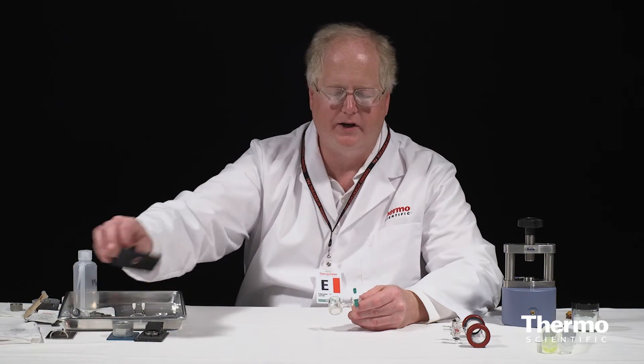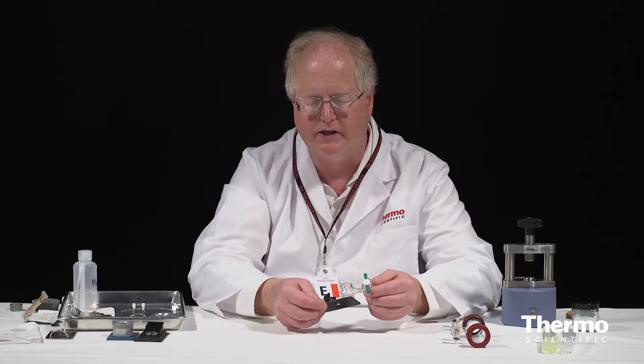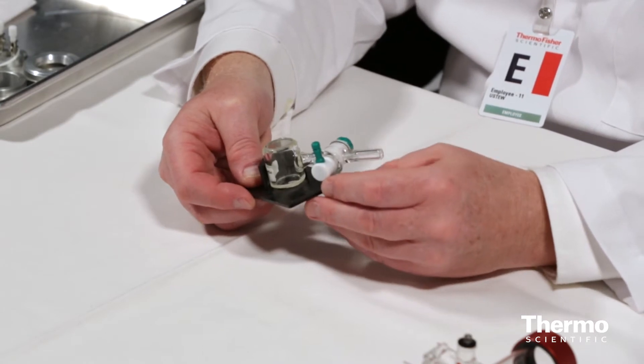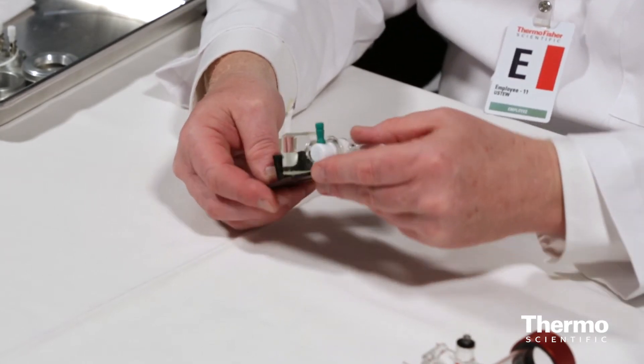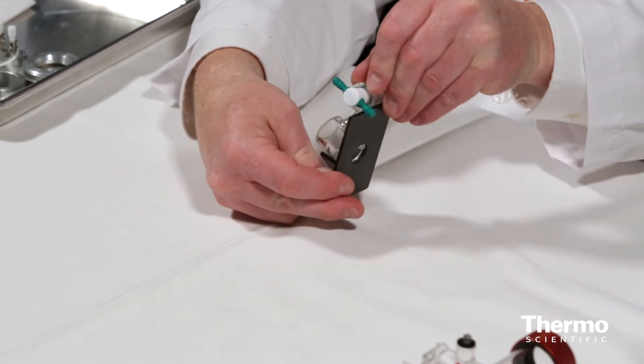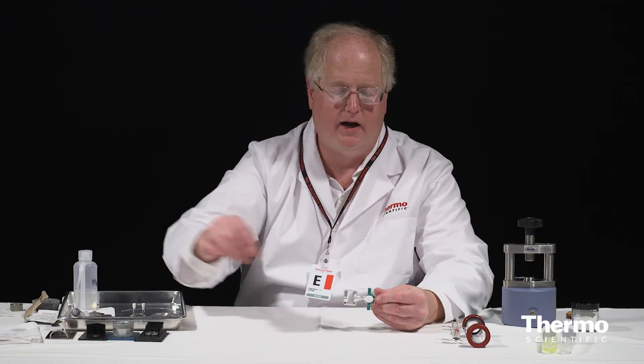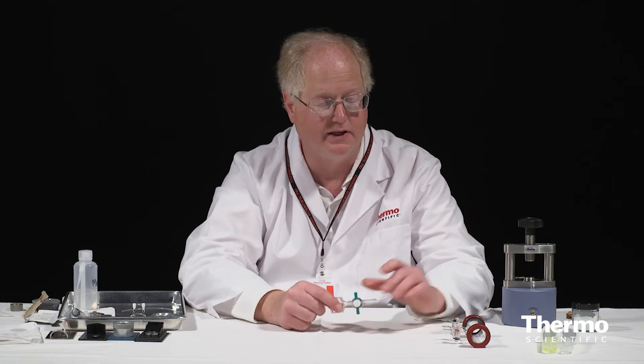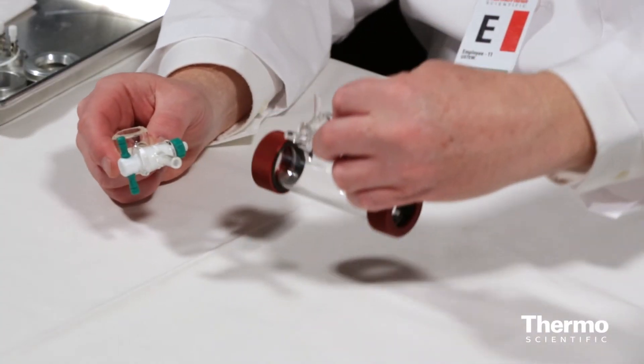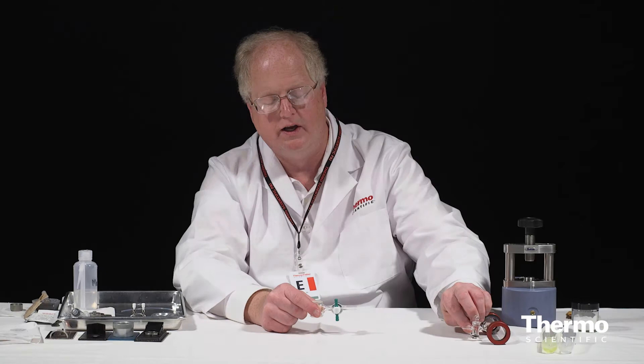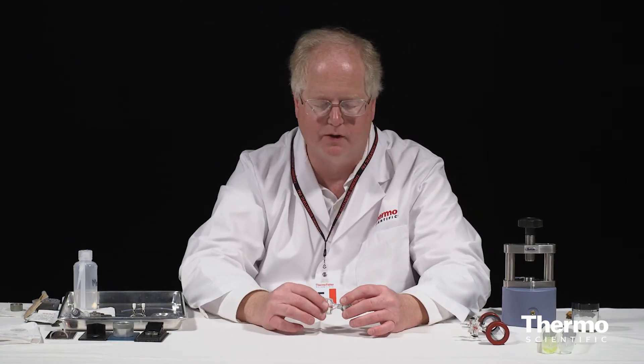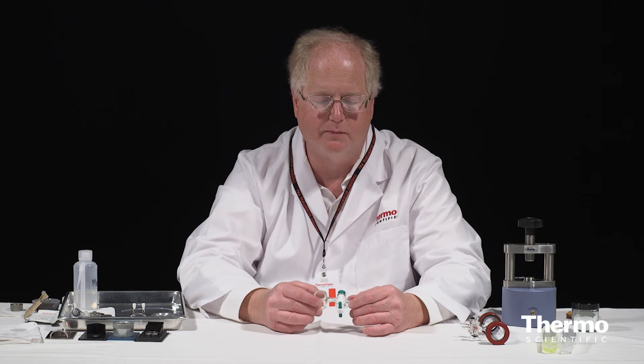These are mounted inside the spectrometer using very simple mounts. It's just a little v-groove which you will see me using repeatedly over in the lab where it just sits down in that groove. There are other types of holders with long bars sticking out or ones in which this sits down into a cradle. It just depends upon the type of gas cell, but I'm just going to be using the simple little v-groove over at the spectrometer.